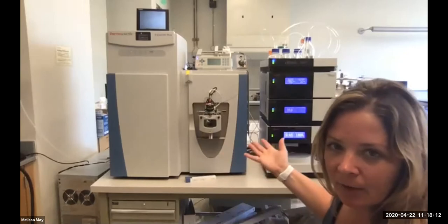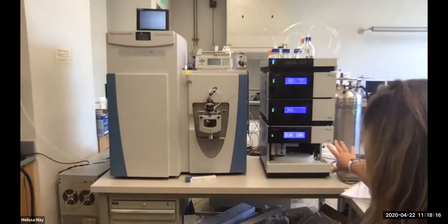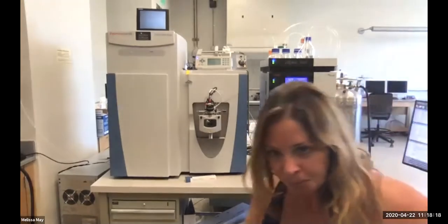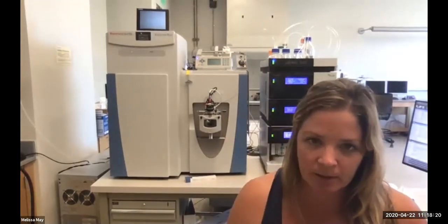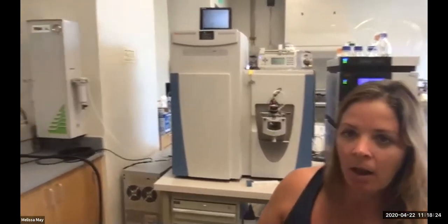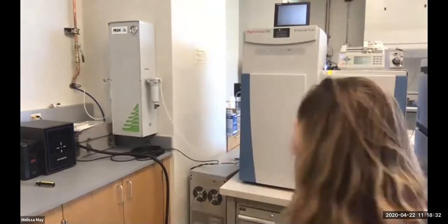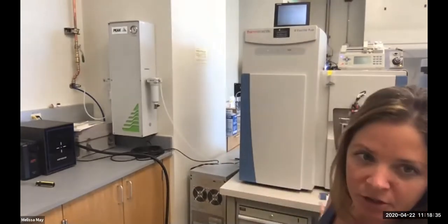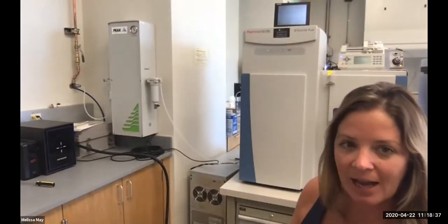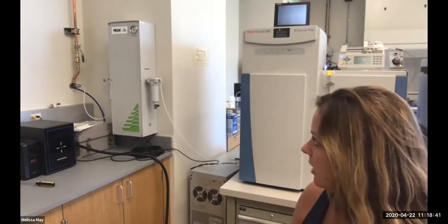So behind me right now, I have the Q Exactive. So we have the mass spec here, and we have the LC pump, and some other components of the instrument that help operate it. Over here is our nitrogen generator. And so the way that we hook nitrogen up to this instrument is for the gases and for the vacuum and fragmentation in the HCD collision cell.